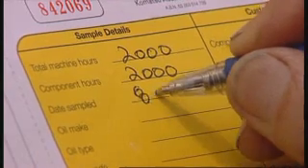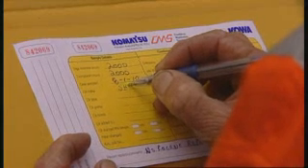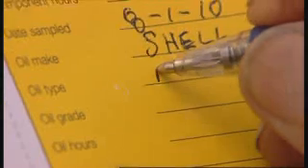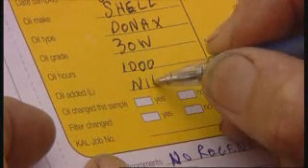It is essential to note the date the sample was taken and also the brand of oil, because this can affect the chemistry of the sample. It is also necessary to identify the type of oil, for example, whether it is for engine, gearbox or even marine application. Viscosity rating is an area of increasing importance. Machines are working to finer tolerances and lubricants are having to work much harder.